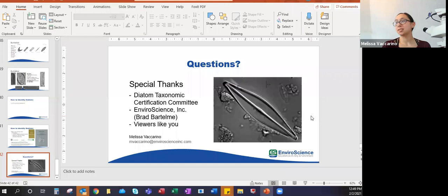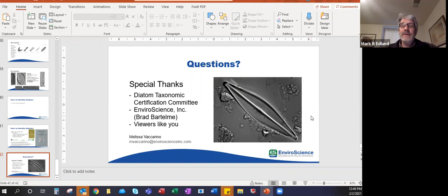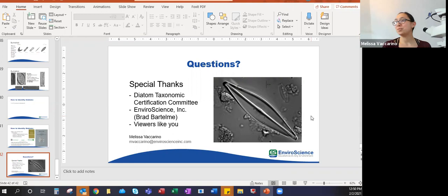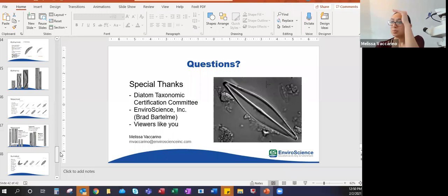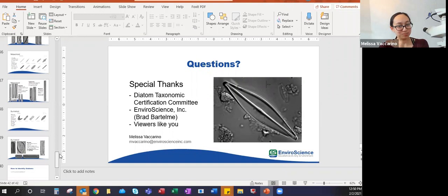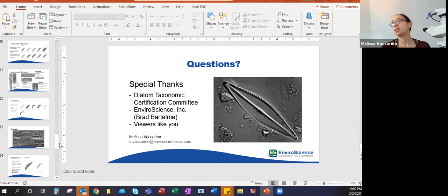All right, thanks. Kyle's asked us, when you're counting striae in a diatom, you introduced in some of the araphids the concept of ghost striae. When you're counting striae density, would you also count those ghost striae? No, I would not. I would pick a more centralized location, between the central area and the apices, where the striae are pretty regular, and I would count the striae in 10 microns in a place like that.